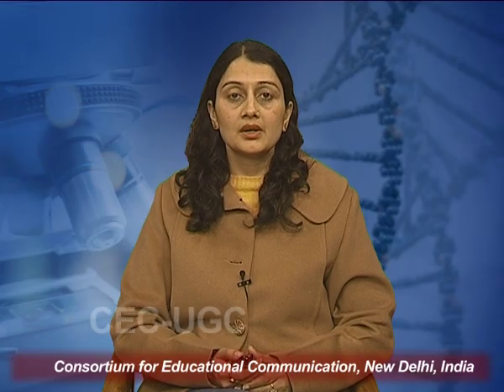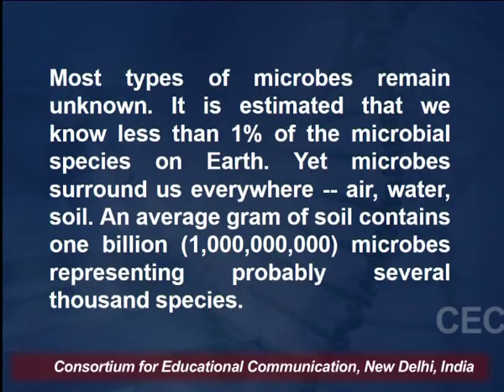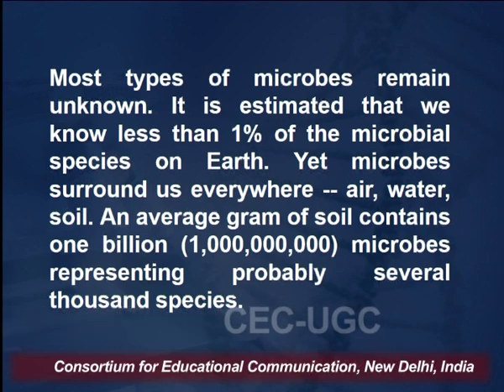So when you decide to study microbiology, you have to culture these microbes, and for culturing these microbes there are certain techniques which one needs to follow, and these techniques are known as sterilization techniques. Most types of microbes are unknown, and it is estimated that we know only 1% of the microbial species on the earth.